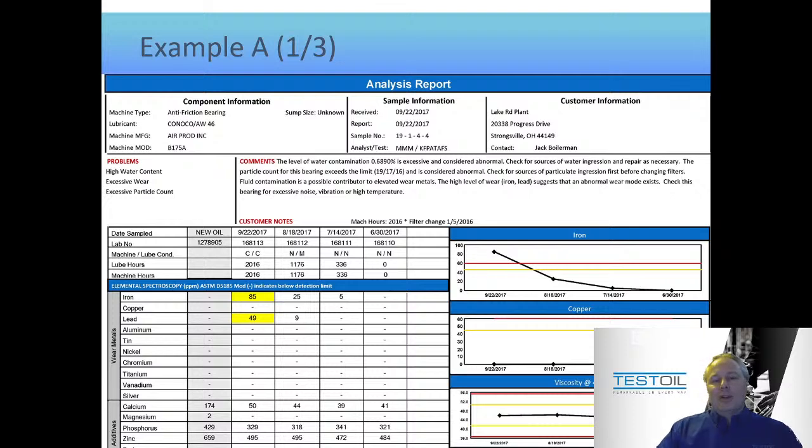So that tells you right there that the first sample's got the shortest interval when it goes to the second sample, but the next 2 intervals, the second to the third and the third to the fourth, are about equal. So if you're picturing what the trend would look like in your mind, there'd be a bigger jump between the second and the third and the fourth sample than there should be between the first and the second sample, just because the intervals are longer on those 2.